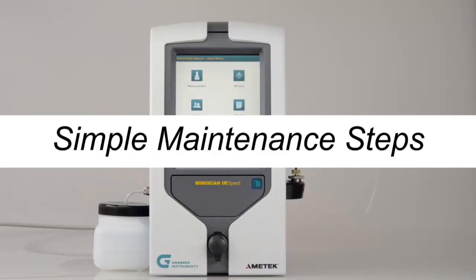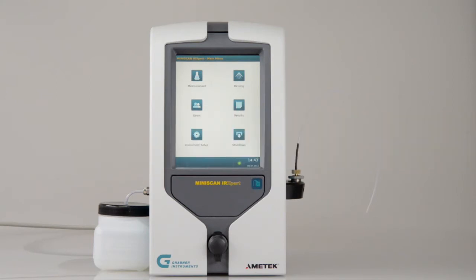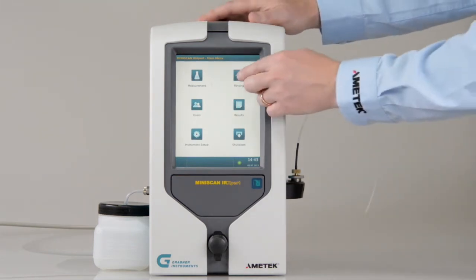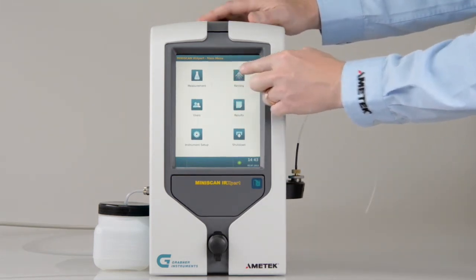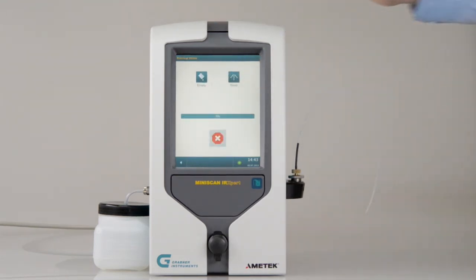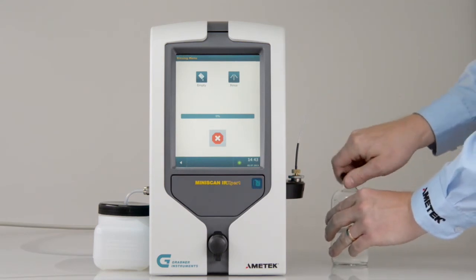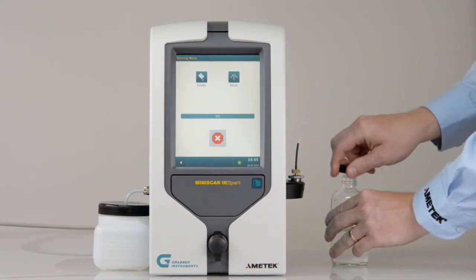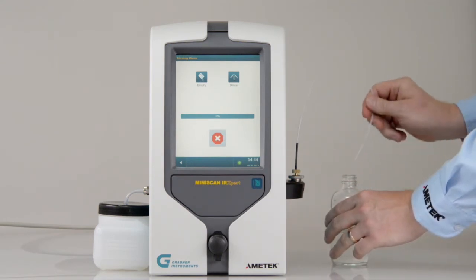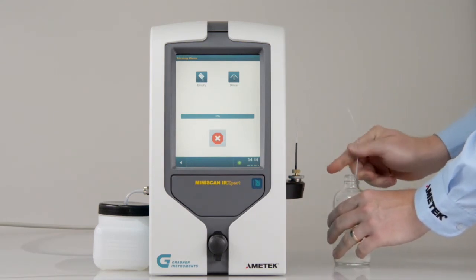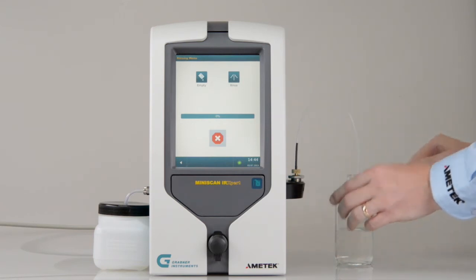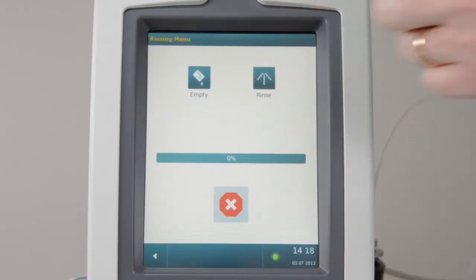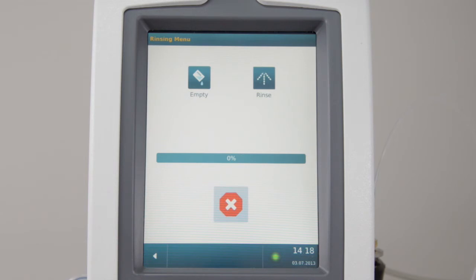Simple Maintenance Steps. Before you turn off the instrument, or if you switch between gasoline and diesel samples, start a rinsing cycle for cleaning. Attach a cleaning solution and press Rinsing. Finally, perform a rinsing with air.